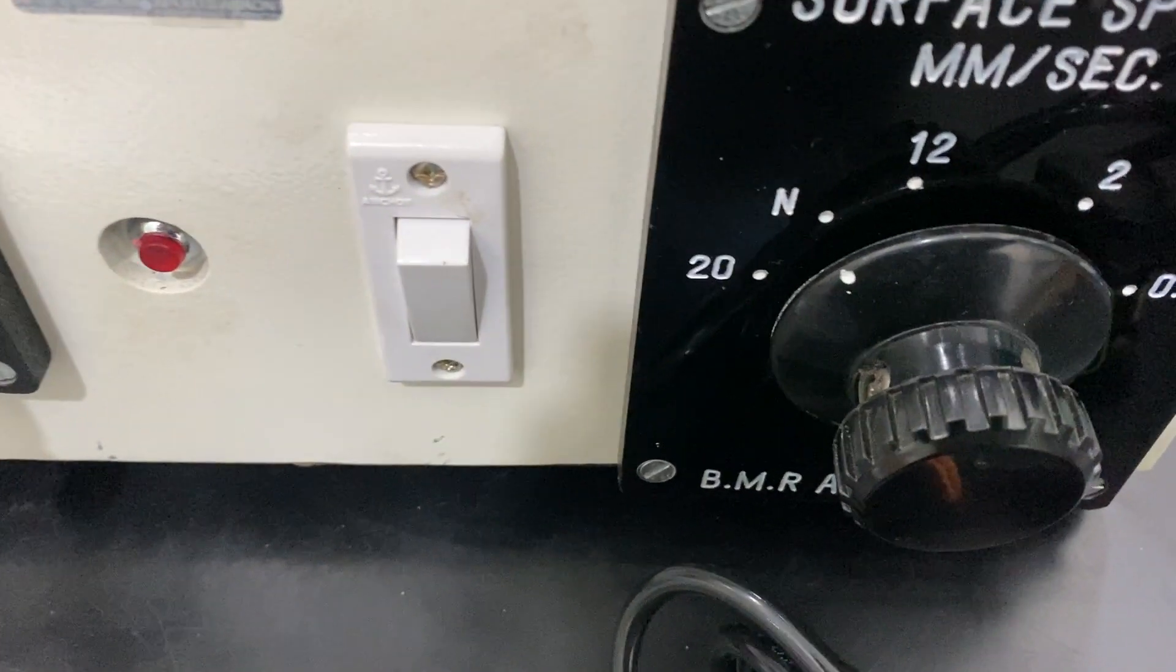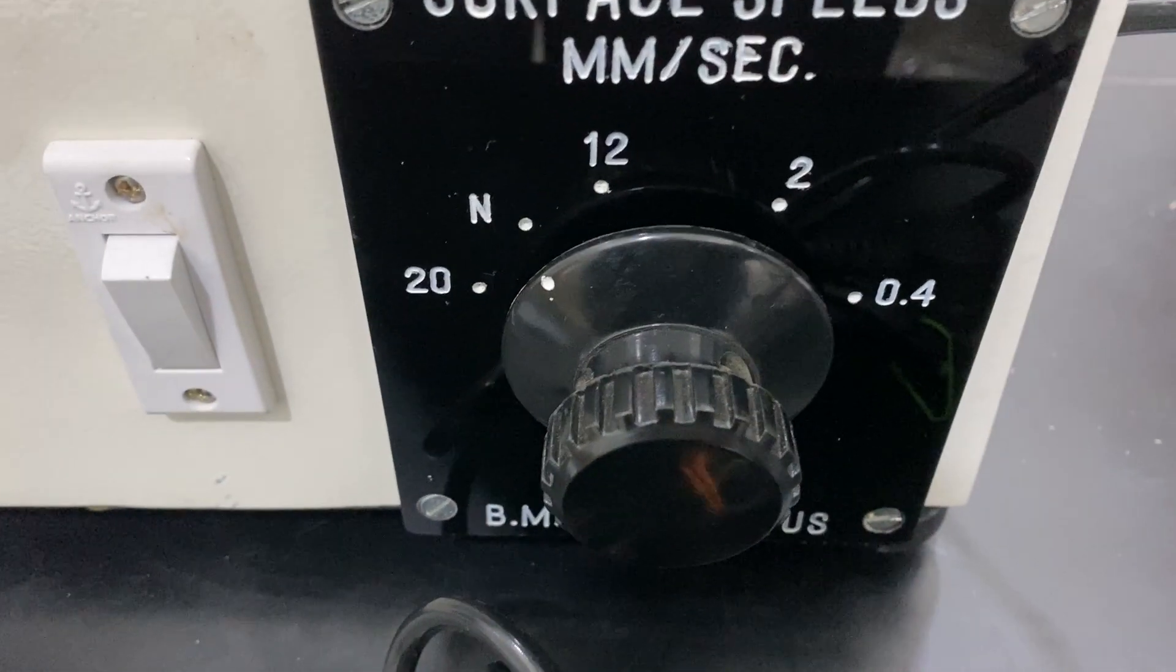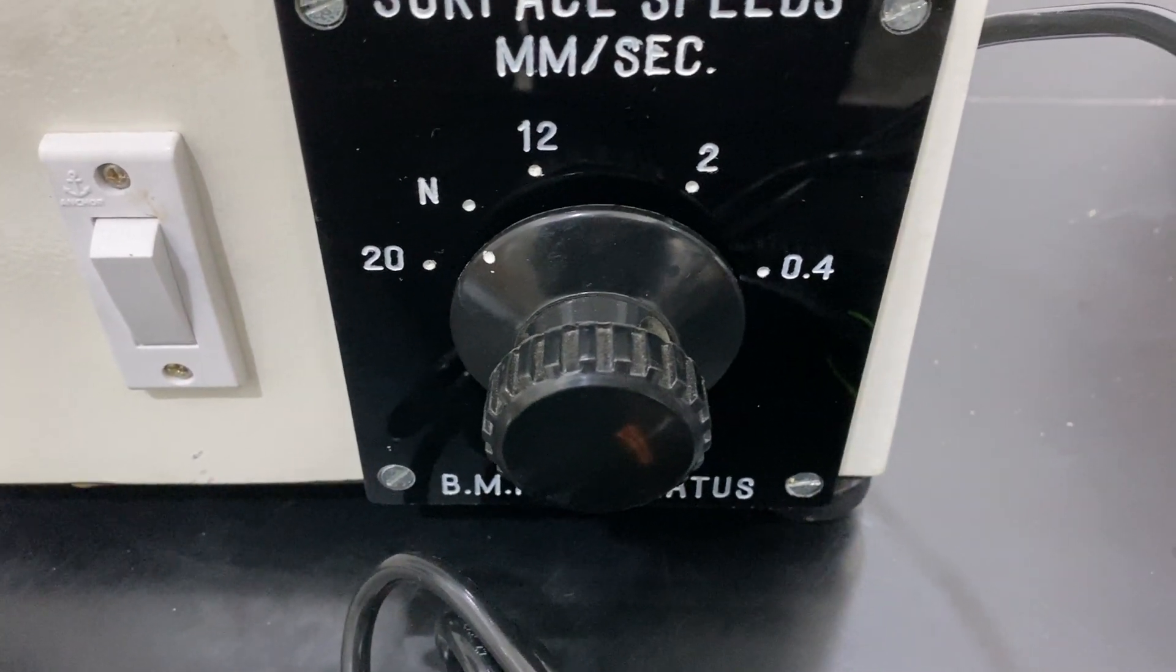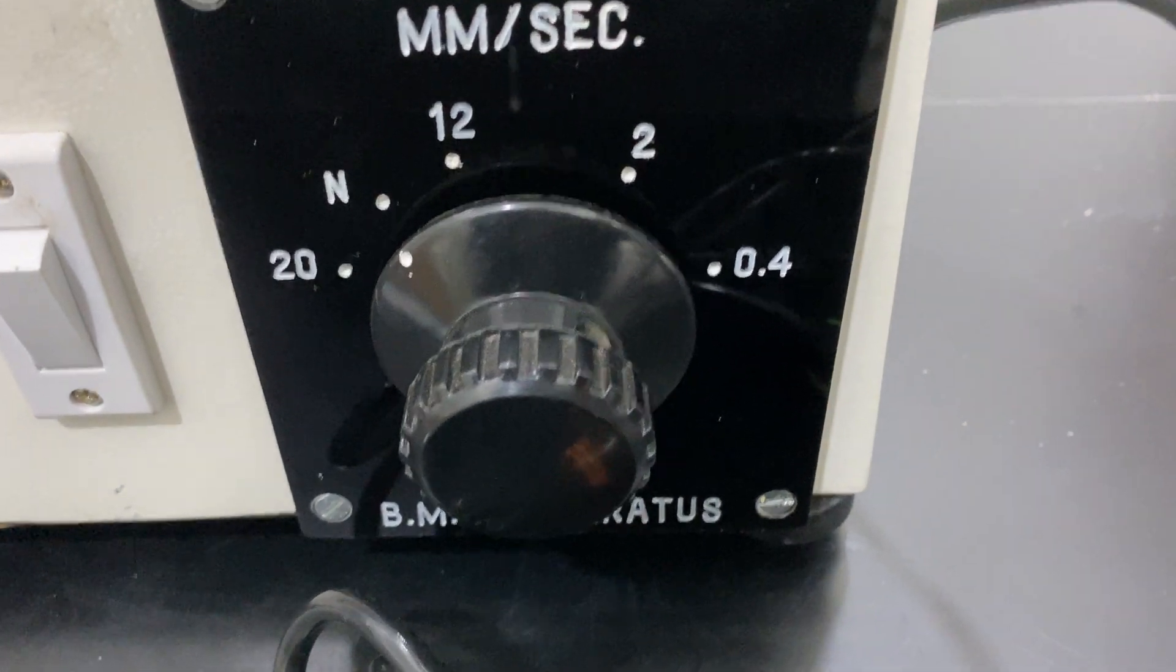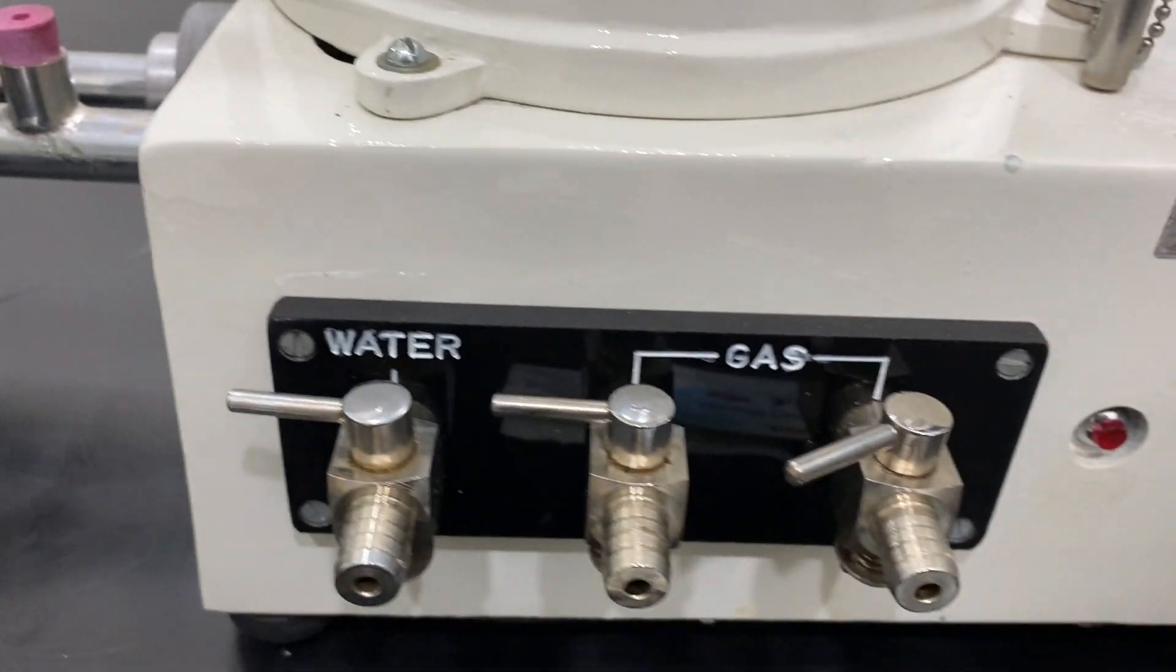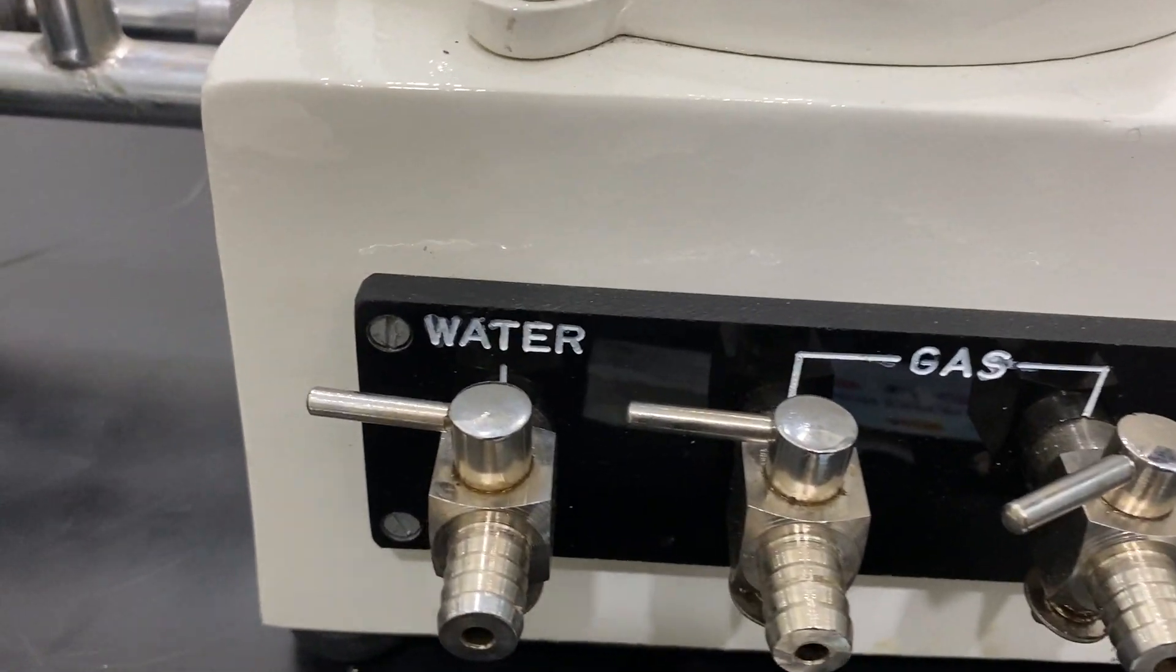These are surface speed settings in millimeters per second, with neutral, 12, 2, and 0.4 on the BMR apparatus. There is an input and output for gas and water.